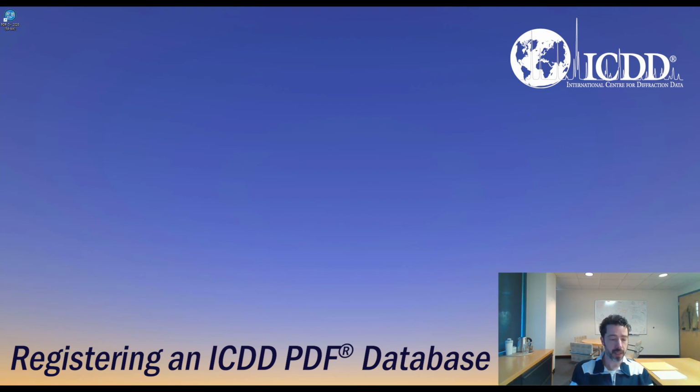In this video, I'm going to show you how to register your ICDD PDF database. Before you begin, make sure your user account has administrative privileges. Otherwise, you will be prompted to provide credentials for an administrative account.